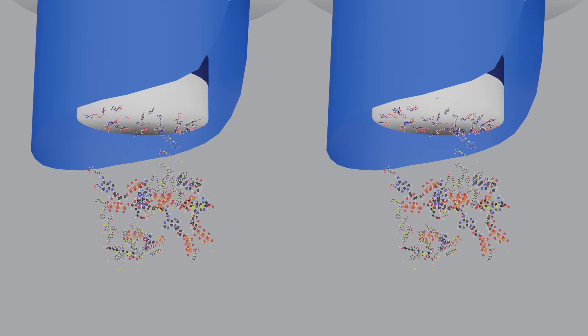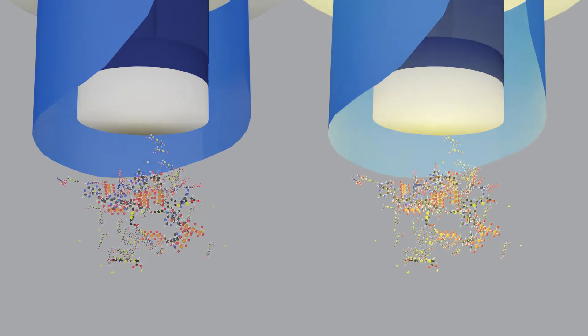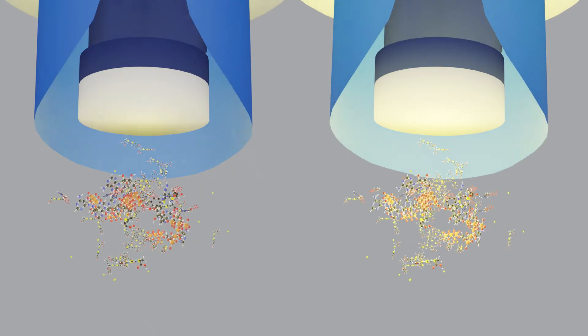The dirtier the surface, the more ATP, and the more ATP, the greater the amount of light.